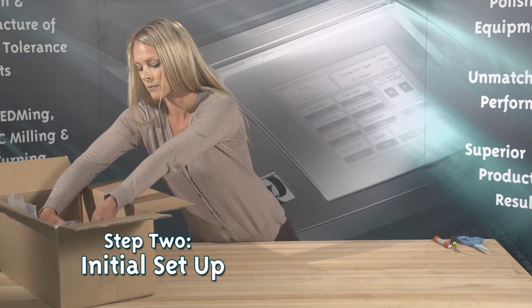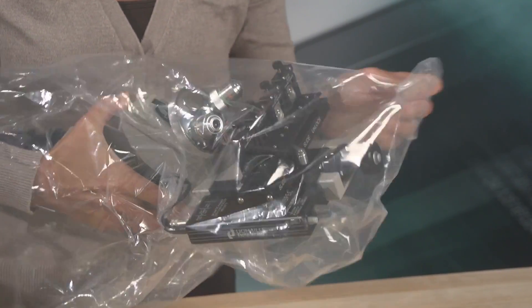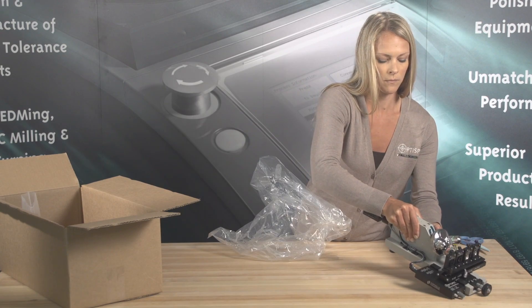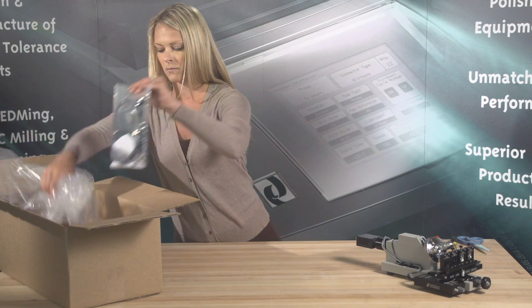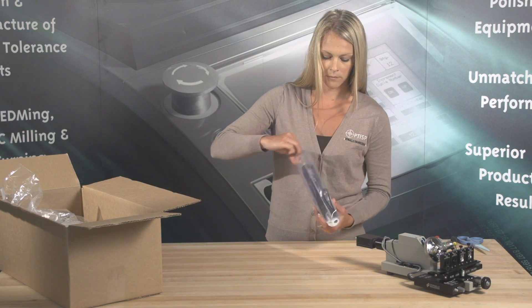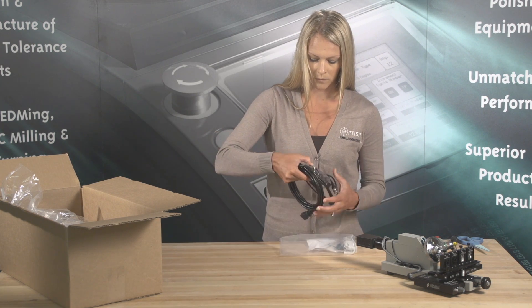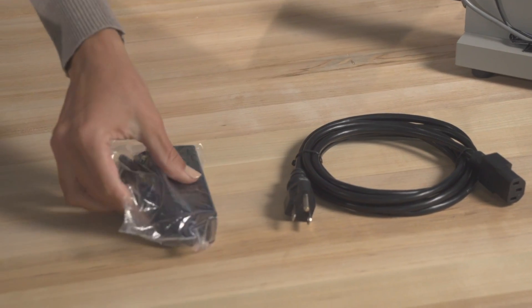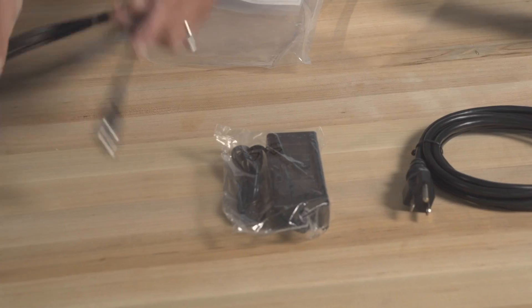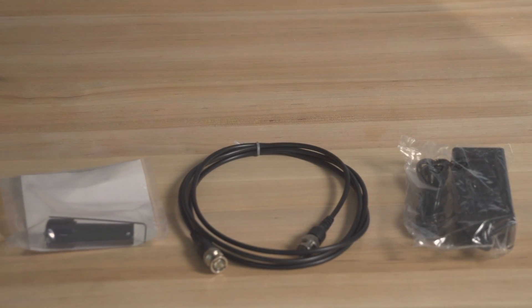Step 2: Initial Setup. Setting up the scope is easy and takes 10 to 15 minutes. First, remove all items from the box and the protective plastic bag. Contents will include a microscope, a power cord, a 24-volt power adapter, a BNC cable, an adjustment knob for the adapter slide with hex wrench, along with a user guide and instructions. Optional monitor and adapters may be purchased separately. The user guide can also be found on our website.